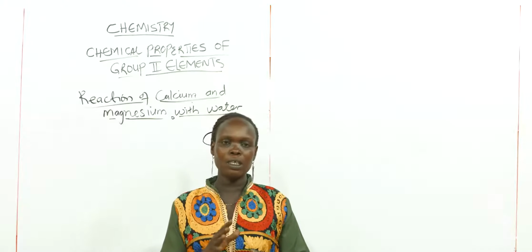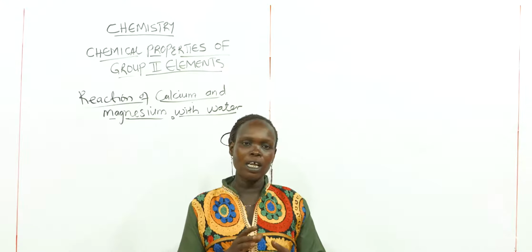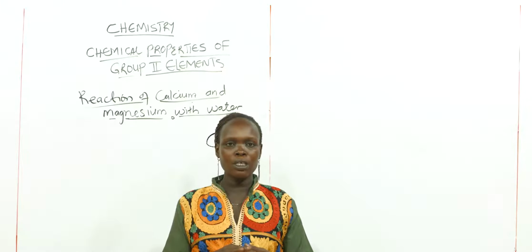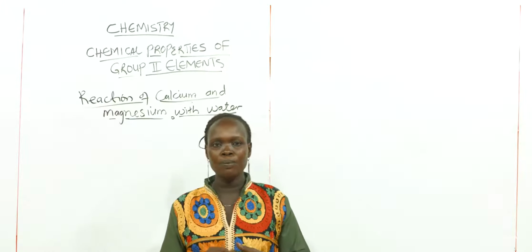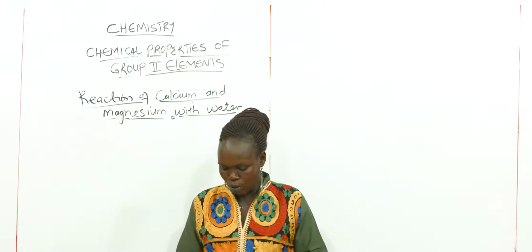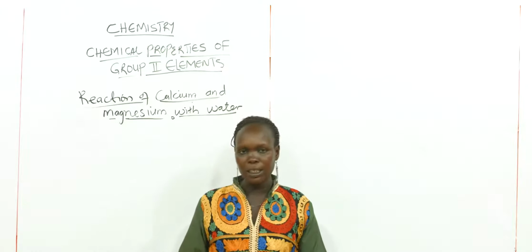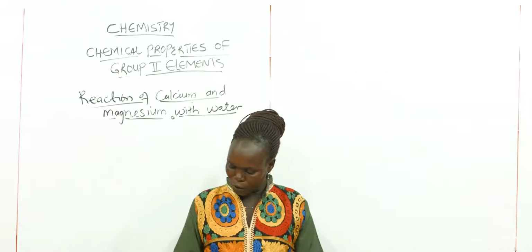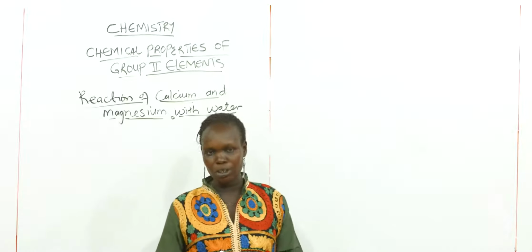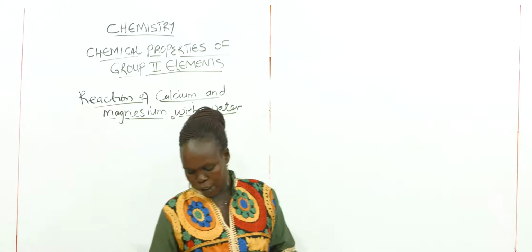And this is representing that when you react calcium with the water, it will give us hydrogen gas, and this sound is the sound that shows that there is hydrogen gas present in that reaction. So we are going to see that the gas collected produces a pop sound, and this is hydrogen gas, confirming it as hydrogen gas.